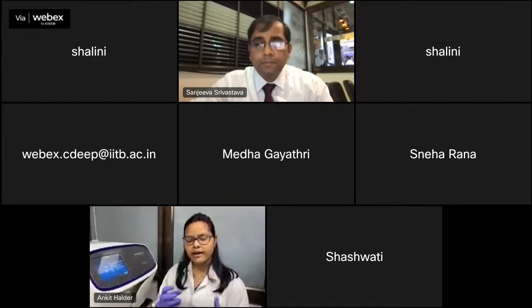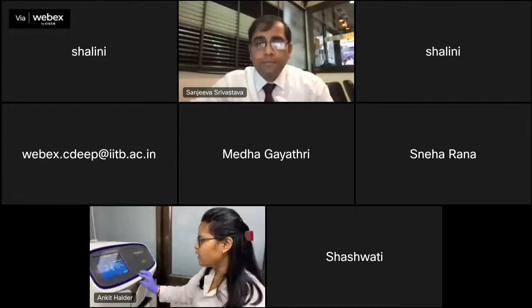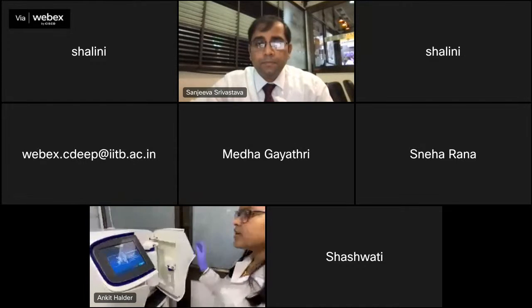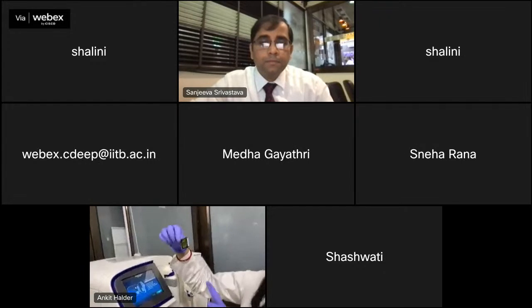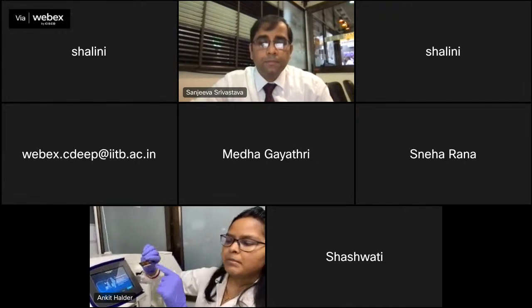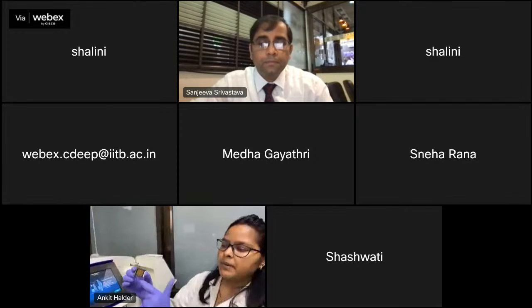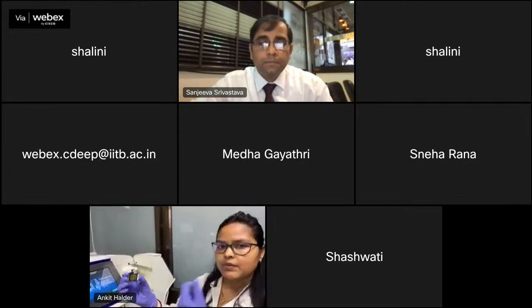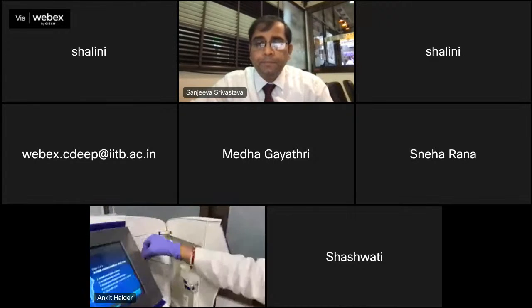Once you have the ISPs, which have all the DNA, you have to load those ISPs on this chip. This chip I was talking about has a lot of pH sensors. Here you can load your samples, and the pH sensor will detect the proton ions, and this chip will go here like this.